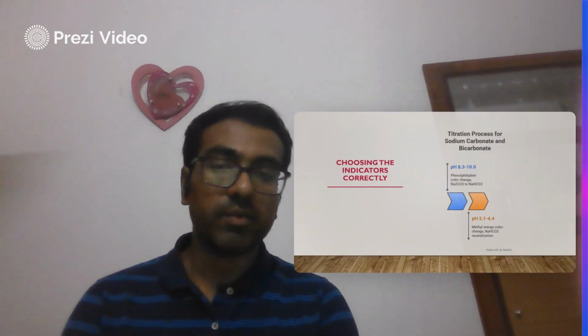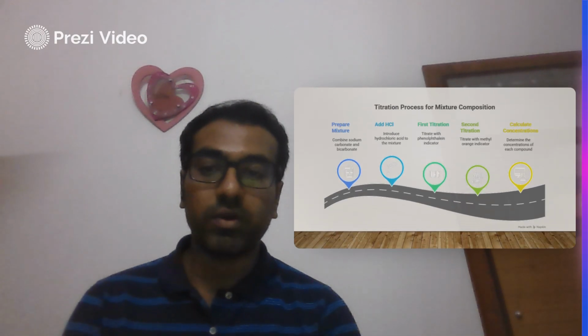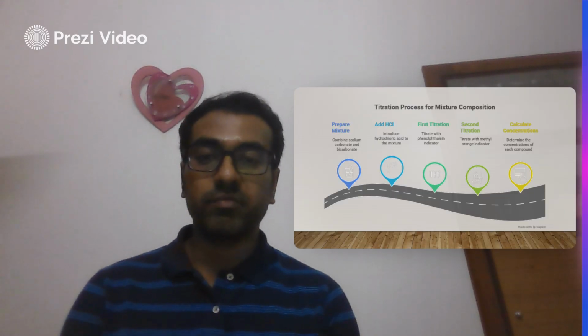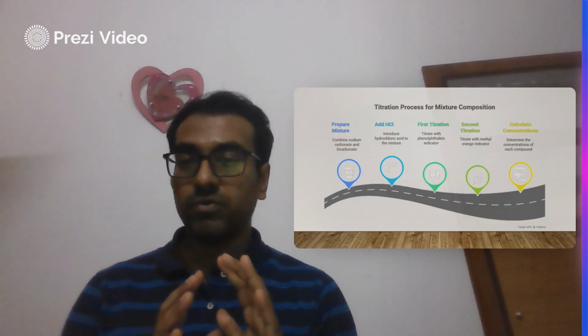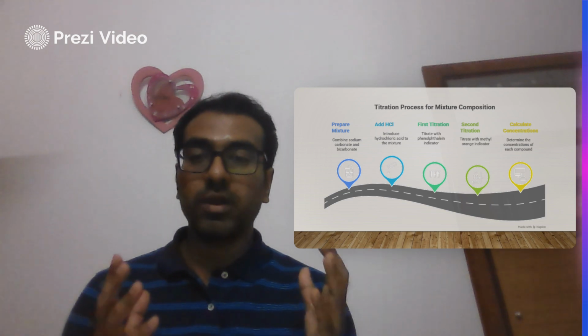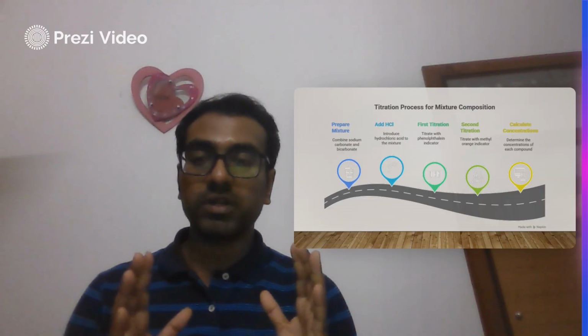Now, if I summarize this short discussion as the pre-lab, what are the steps that we are going to have in this experiment? 5 steps, right? So what is the first step? In the first step, we are going to make the mixture. You don't need to prepare the sodium carbonate solution, nor the sodium bicarbonate solution, because they're unknown, so they will be provided. What is your job?